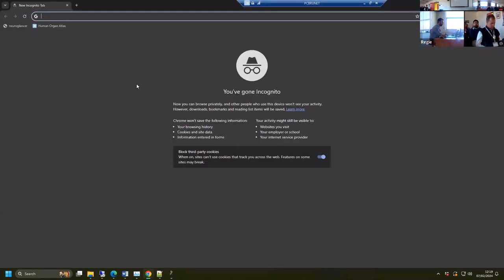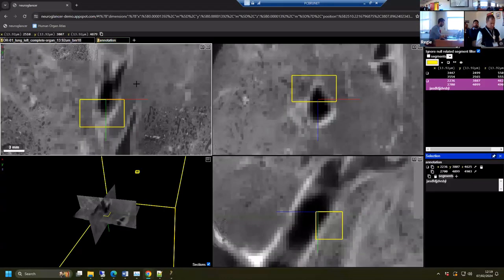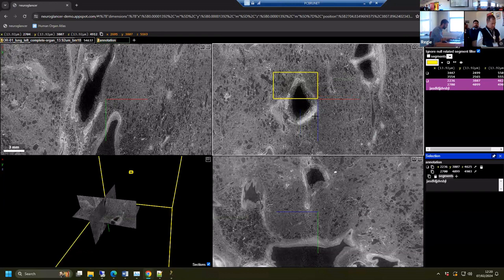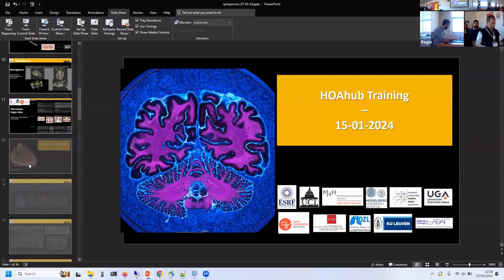So we'll just say like you open a new window. And normally if it works, yes, it's exactly in the same place with the same annotation that you wrote. So you can quickly work between collaborators, do annotations, write label stuff. So it's very nice. And you can work like this on very huge data sets, so it avoids all the transferring of the data between collaborators. So this is one of the tools that we use quite a lot.